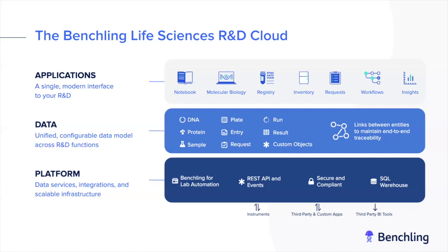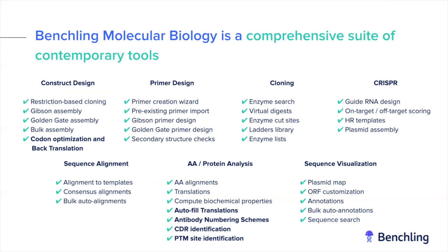Today, we'll be focusing on the molecular biology suite, though. And the molecular biology suite is really a whole suite of different modern tools that enable a variety of different molecular biology-related tasks, ranging from construct design and cloning to more specialized tools for CRISPR guide RNA design and antibody discovery. Damien is going to be walking through many of these tools in his demo shortly, so I won't go into too much detail on each of these.